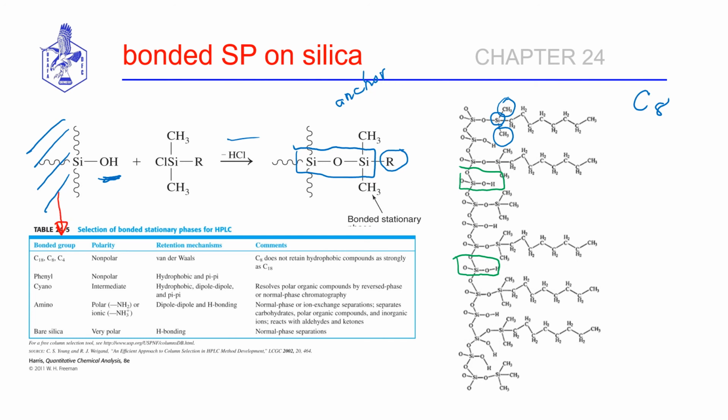and we went through how one goes about choosing what's most appropriate, but most commonly you can look for, in terms of the R group that's sticking out here, C18, C8, C4 groups, those are very nonpolar. Okay, for other kinds of samples, a phenyl group might be more appropriate.